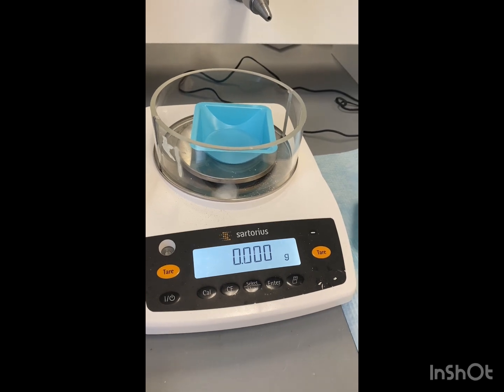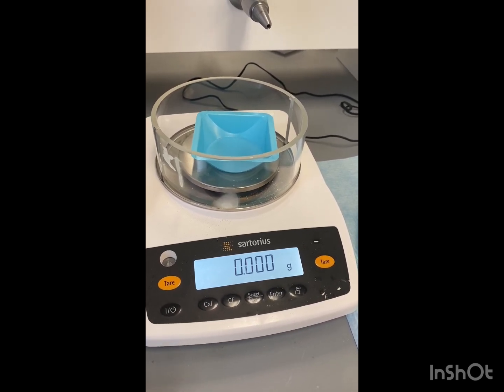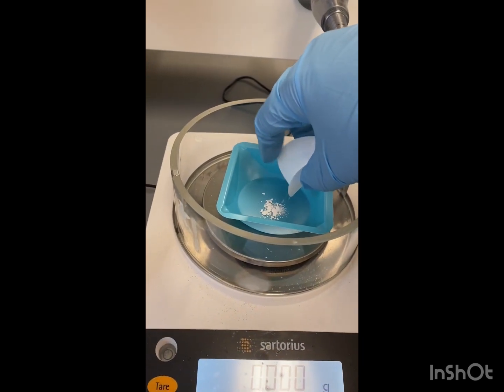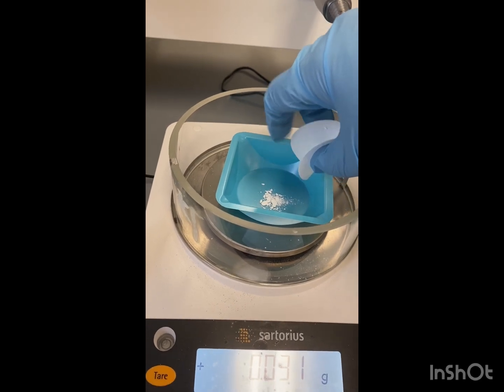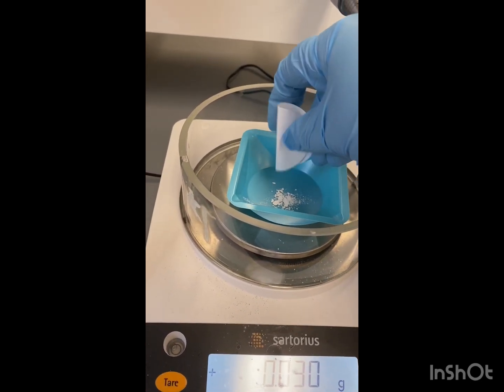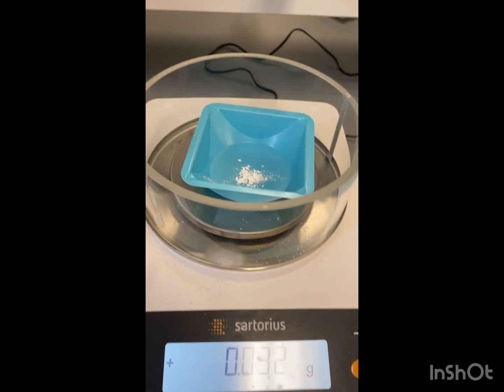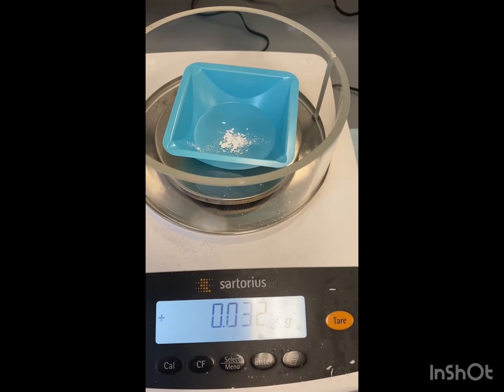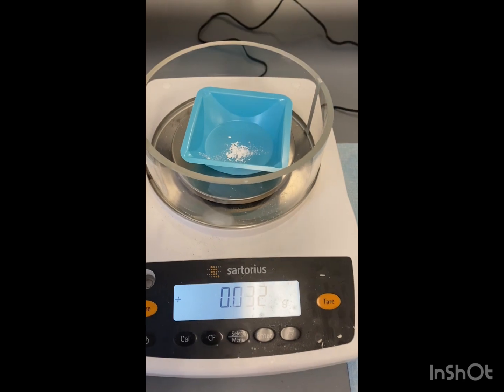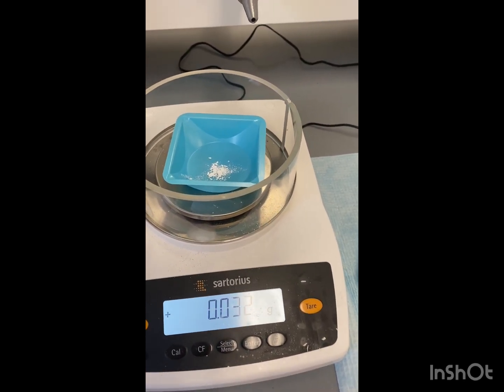So now we're going to weigh our S-phenylsuccinic acid that's been drying. Go ahead and weigh it. Alright, looks like we've got 0.032 grams. Alright, so we're going to take this and obtain a specific rotation.